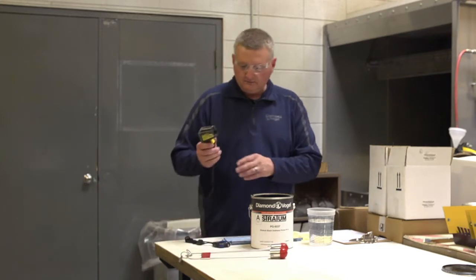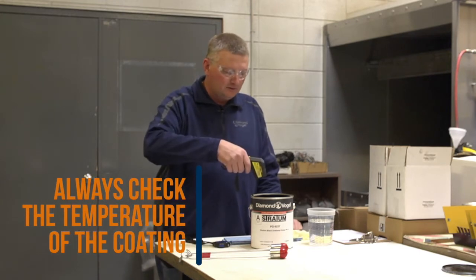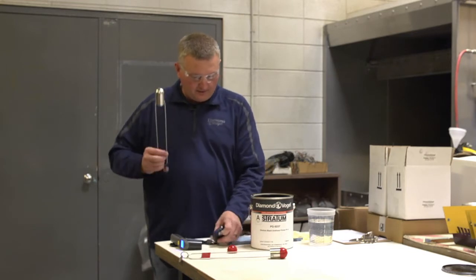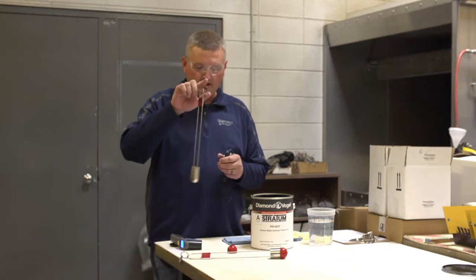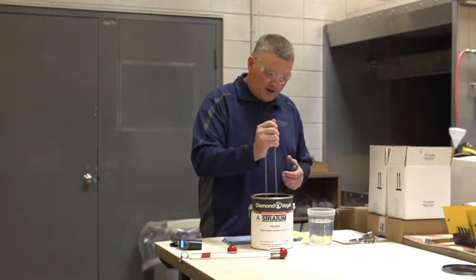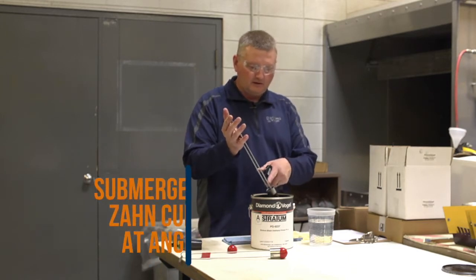So to check your viscosity, you want to check your temperature like I said before — 75 degrees. Take a number two Zahn cup like we talked about, placing your finger in the ring so that it's free floating. You want to put your cup in the material and you want to submerge it at an angle.